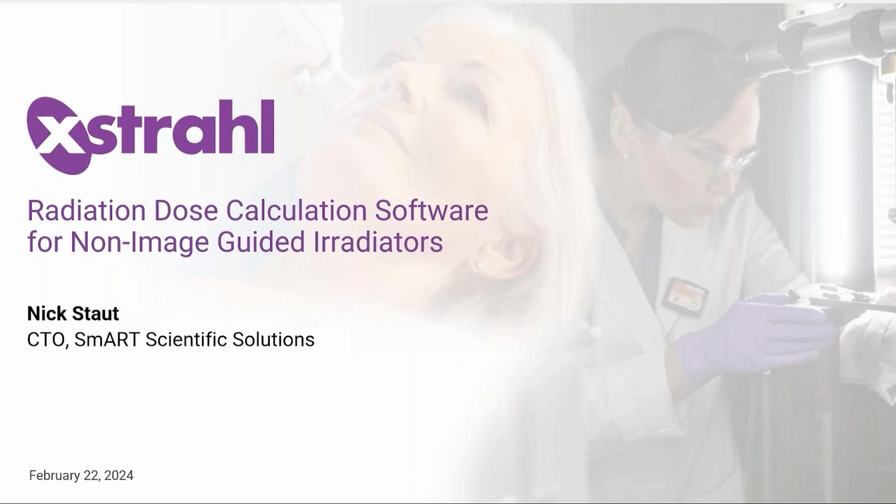It is with pleasure that I am joined by Nick Staut, the CTO from SmART Scientific Solutions, and by Frank Verhaegen, co-founder of SmART and professor at the University of Maastricht. Nick is going to present on another highly innovative tool developed by SmART Scientific Solutions, which addresses the need for better dosimetry and reporting for cabinet irradiators.